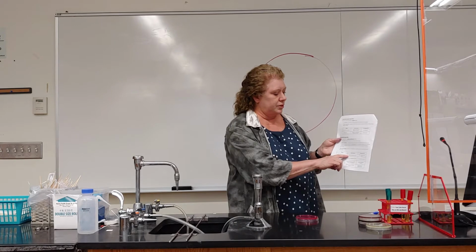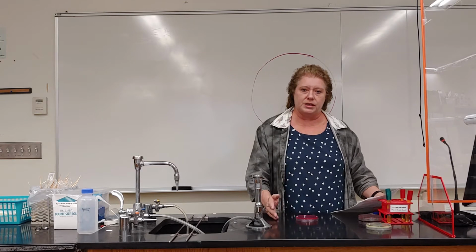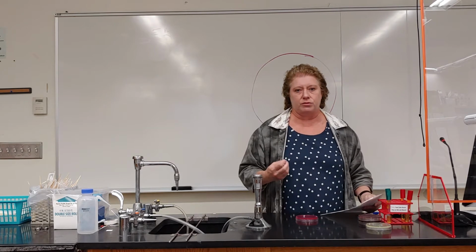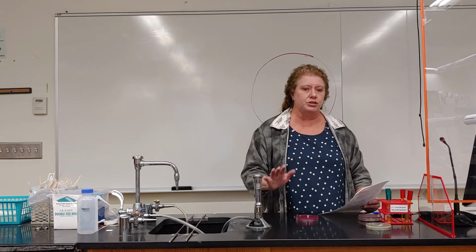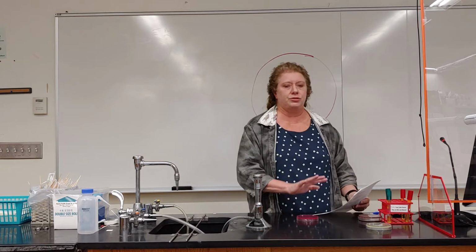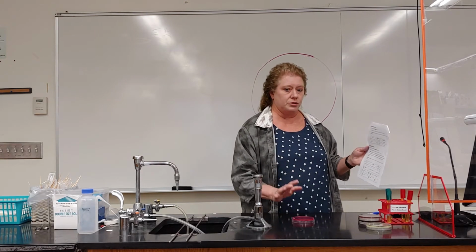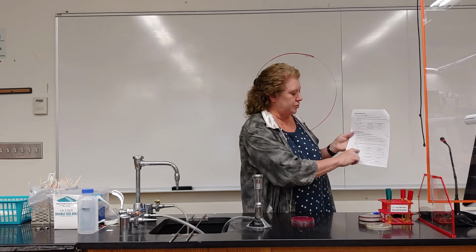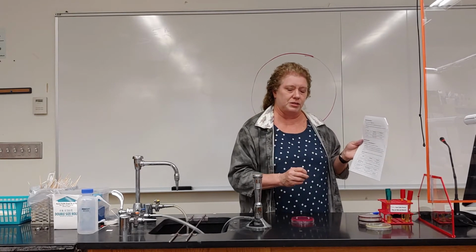So that is telling you the interpretation that the organism is inhibited by salt. It cannot grow on the NaCl, so it's inhibited by the selective ingredient. That tells you that it is not a Staphylococcus species, which makes sense because you put E. coli in here, so it shouldn't have grown. It should have been inhibited by NaCl. In that case, you can't tell anything else because nothing grew on this plate. So your results for that plate that has no growth on it would be across here, letter A, poor growth or no growth. The organism is inhibited by NaCl, and it is not a Staphylococcus species.